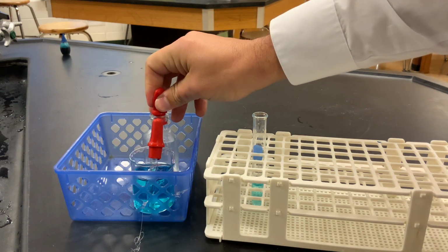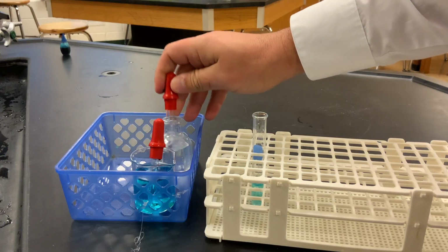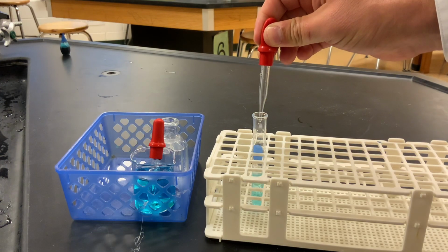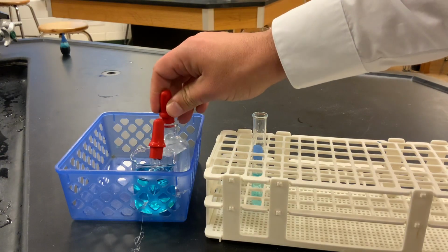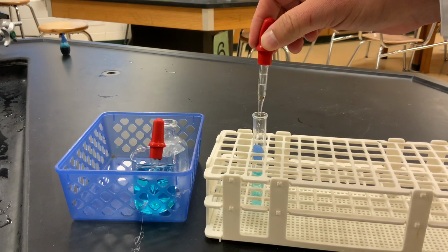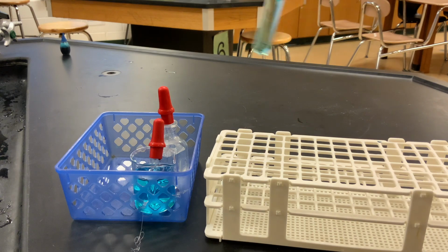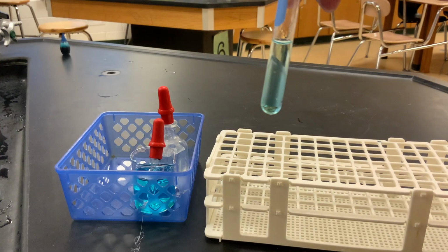Now, this other substance, I'm not going to tell you what it is, but if we're looking to see if mixing is occurring or dissolving, I'm going to do the same thing. I'm going to add 2 dropper bottles full, again being sure not to touch the edge of the test tube. And then I'll just grab another one. And just make sure you put the dropper all the way back in when you go to pick up the second dropper bottle. And then what I would do is lift the test tube up, give it a swirl, maybe 10 or so seconds. And what I'm looking for is whether mixing occurred.